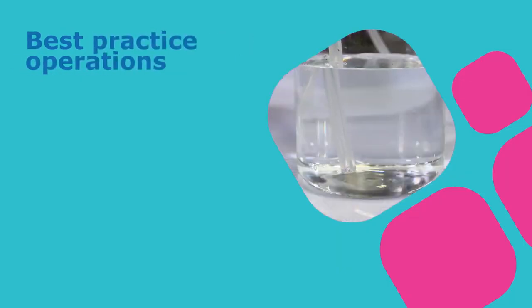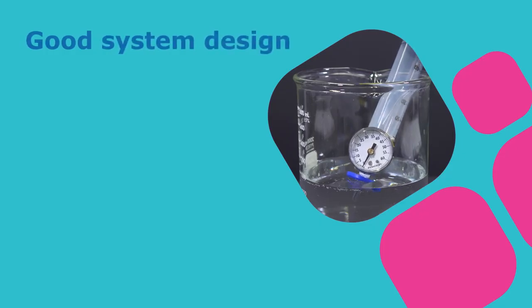In this video, we'll look at the science behind integrity testing in order to understand what is happening at a micro level. This will provide the foundation for good system design, operations, and troubleshooting. A filter integrity test actually tests all critical pathways between filter upstream and downstream, including seals and device components. But the primary consideration is the membrane. So let's start by looking at the membrane structure and materials and trying to understand what is happening in the pores of the membrane during a test.